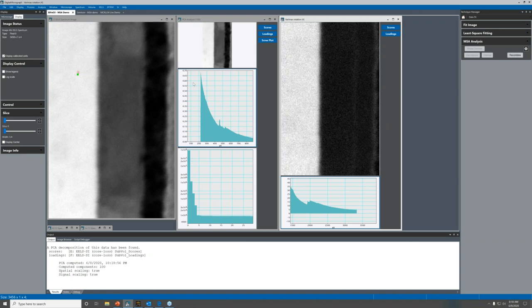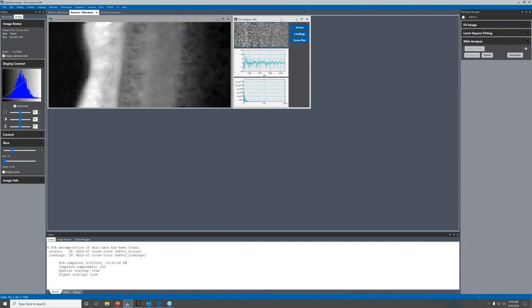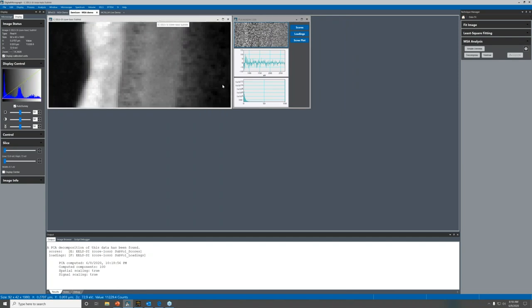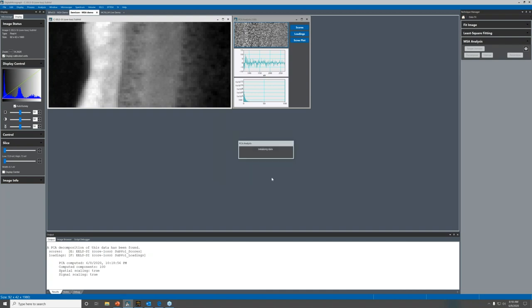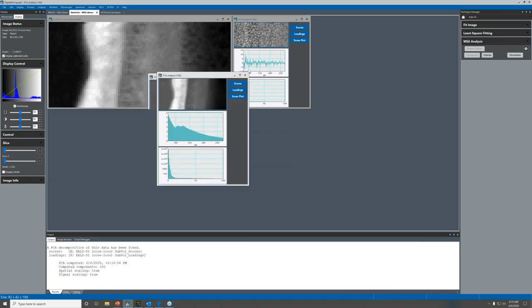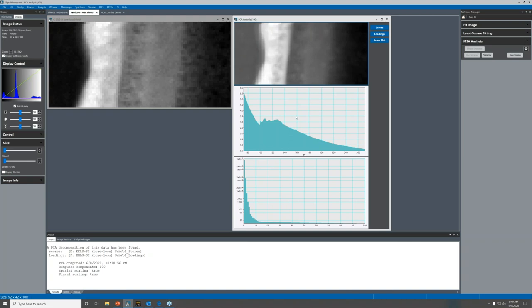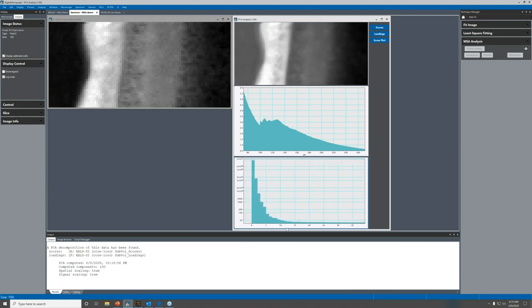What about a dataset that's a little more challenging? Jumping over to the semiconductor dataset — I've already run the decomposition, but let's run it again on this smaller dataset so you can see how it runs. We just hit decompose with the spectrum image selected. We end up with the same output: scores, loadings, and a scree plot. But with this data, it's much less obvious where to say it's noise or real data, because the gradient is a shallow change rather than a very abrupt change.